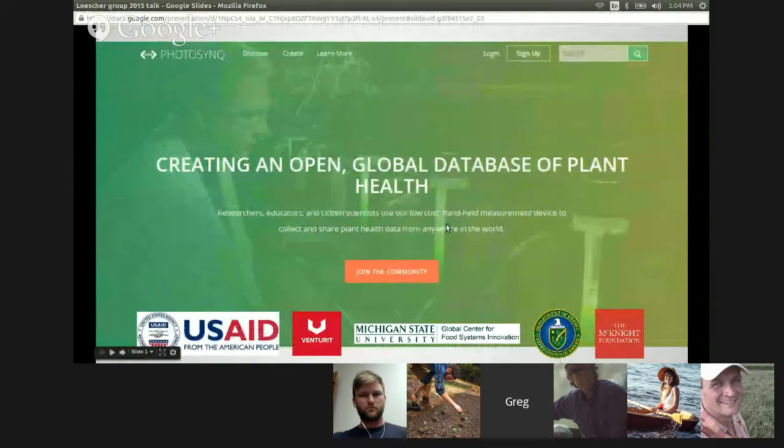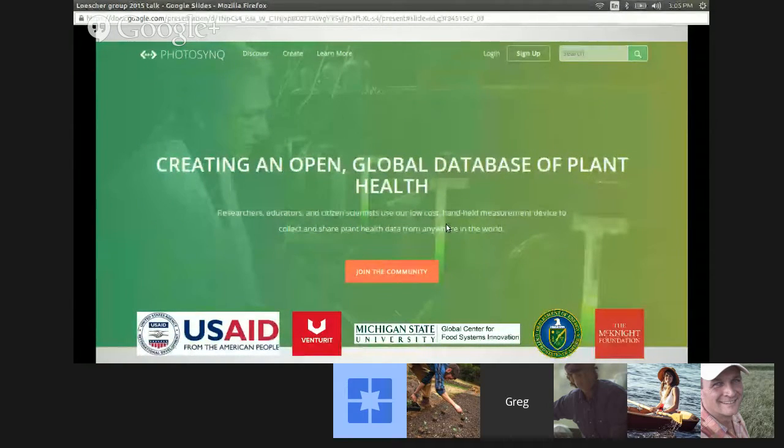All right. So Photosynq, we've been working on this project for a little over 2 years, probably 2.5 years now, and our goal is to create a platform in which anyone can quickly and easily create, share, and analyze plant health information. Our lab is really focused on photosynthesis. It's a Framer lab. Dave Framer's the head of the lab at MSU in the plant research lab.